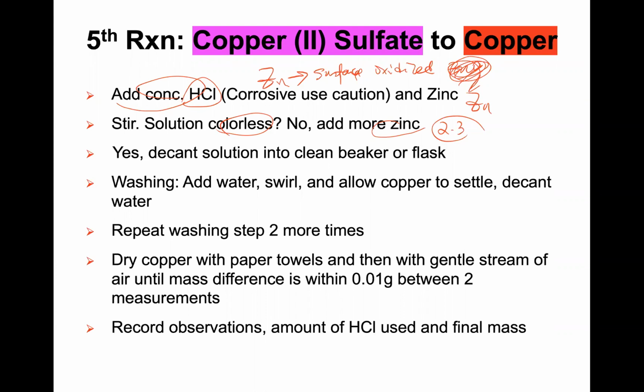After the reaction, you need to decant the solution into clean beakers, and wash. Once you collect the copper, you can dry it with paper towels and try to remove the moisture as much as possible.